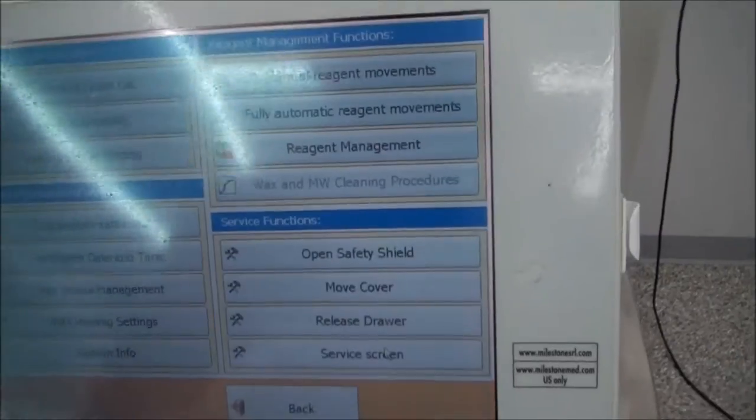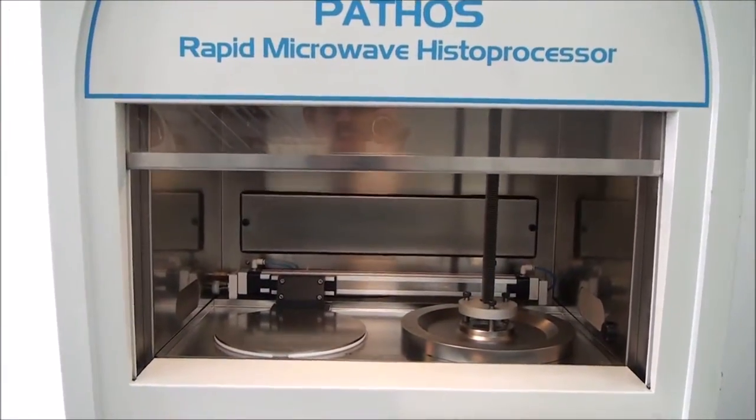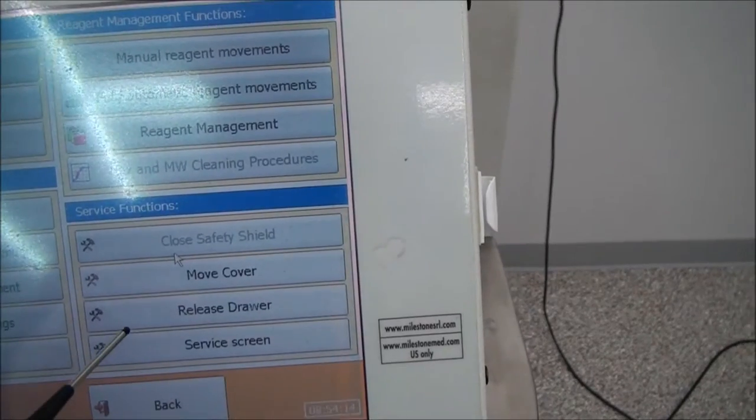Here you can see that the chamber safety shield is closed. To open the safety shield, simply touch the Open Safety Shield button on the main screen. Once the safety shield is completely raised, the option to lower the shield will become available.